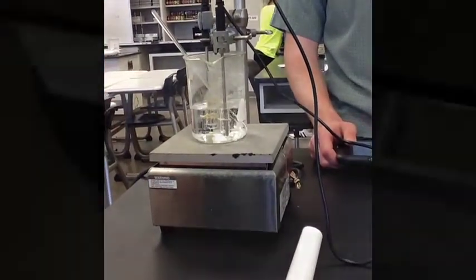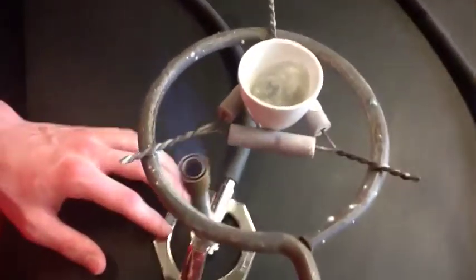So that's the plan. Now here the salt is melting in the water bath. Right now the salt is being heated in order to remove the water, but the key here is to not let it boil over, so sometimes the heat needs to be removed and applied periodically in order to do so.